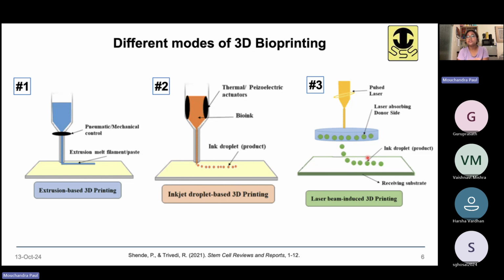So here there is no moving head, right? There is no syringe, there is no print head. There is a stationary receiving platform, and a stationary container reservoir of bioink, which is protected by an absorbing layer. What is moving here is the light. Wherever the laser is pointed on the substrate, from there a droplet of bioink is dispersed and comes off on the platform. So here the unit of bioprinting is the droplet, that is the same.